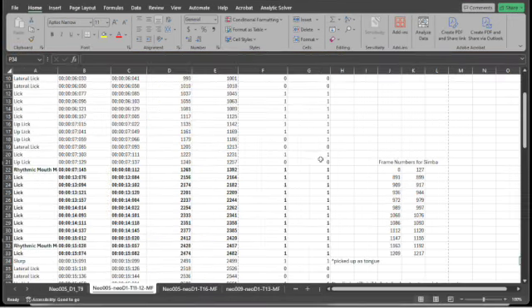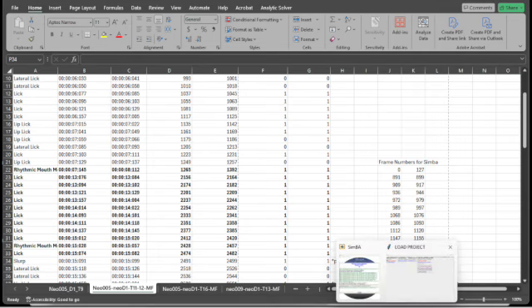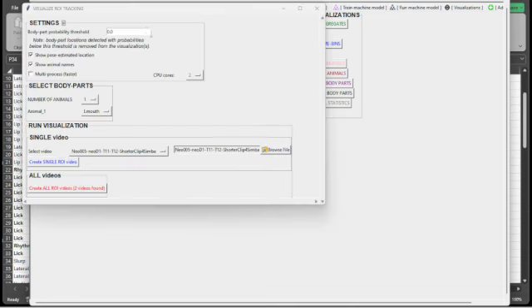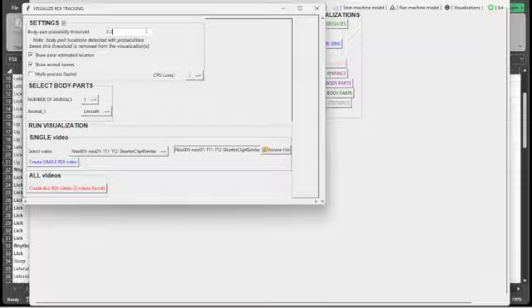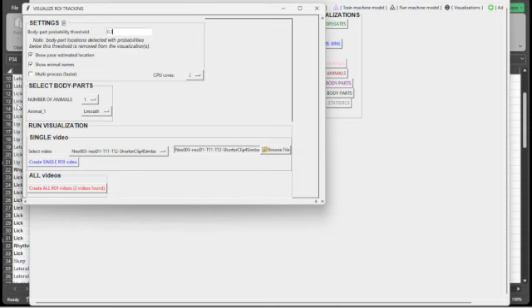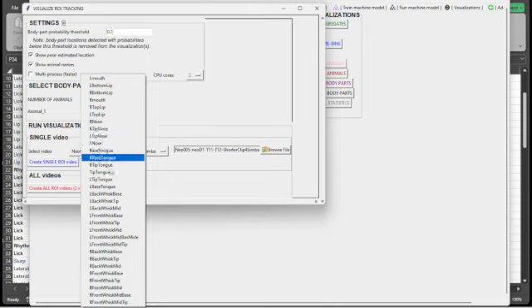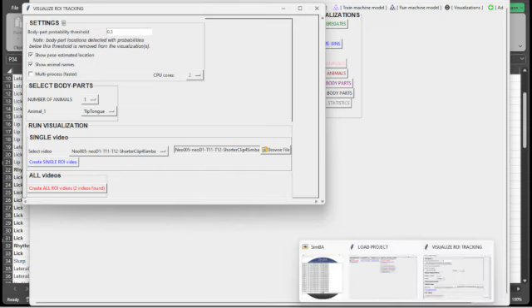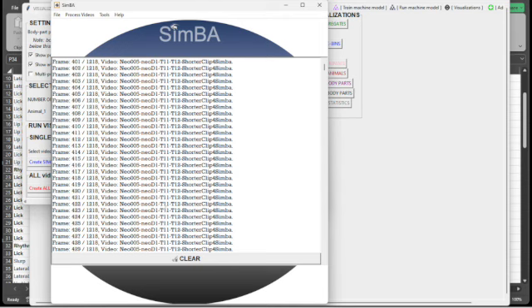And then I can minimize that and visualize that ROI tracking data. So if you're confused on some of the data that's being presented in that detailed ROI, you might visualize it. And this will take longer. I have just a very short clip, so it won't take too long, but if you have a full trial, this will take a while for it to go through every single frame.